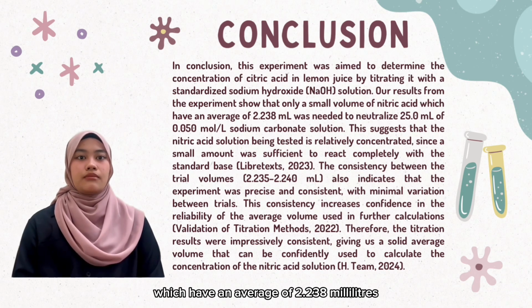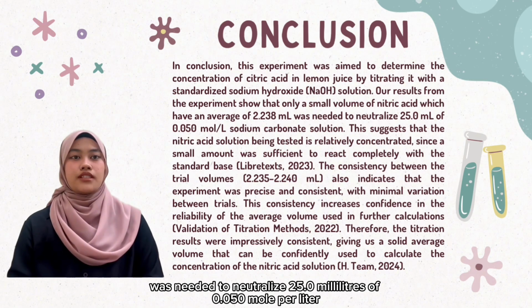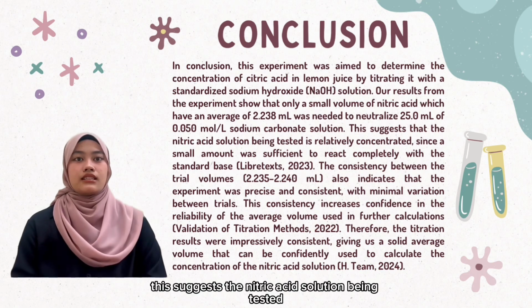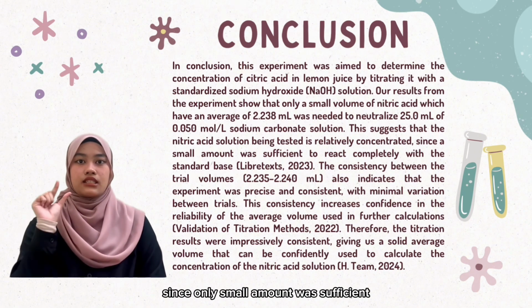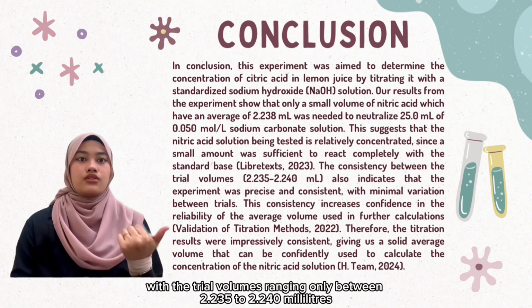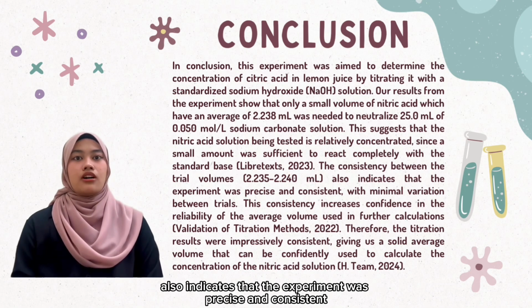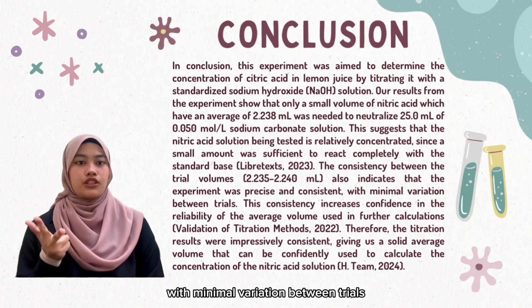2.238 ml, was needed to neutralize 25.0 ml of 0.050 mole per liter sodium carbonate solution. This suggests the nitric acid solution being tested is relatively concentrated, since only a small amount was sufficient to react completely with the standard base. The results were also very consistent, with the trial volumes ranging only between 2.235 to 2.240 milliliters, which also indicates that the experiment was precise and consistent, with minimal variation between trials.